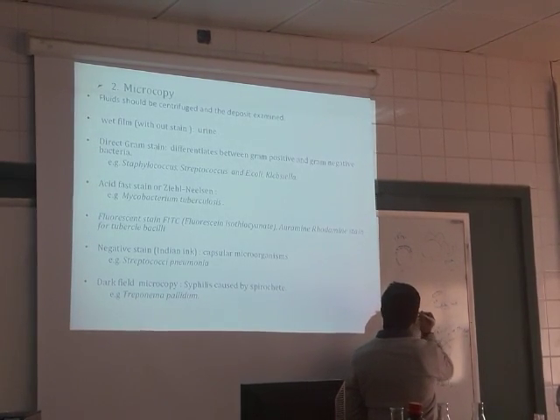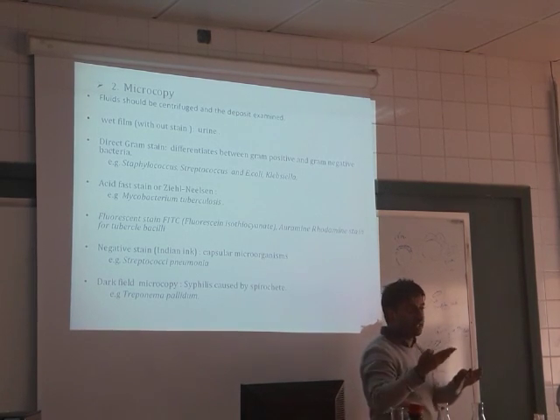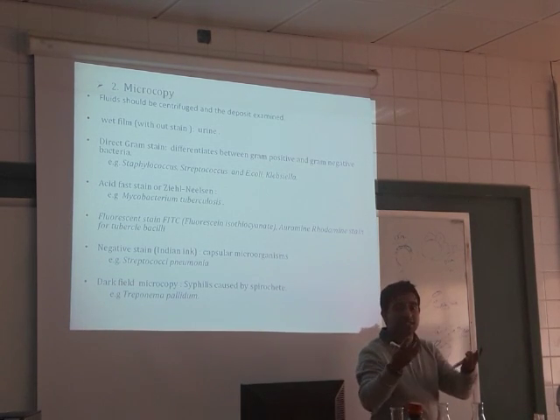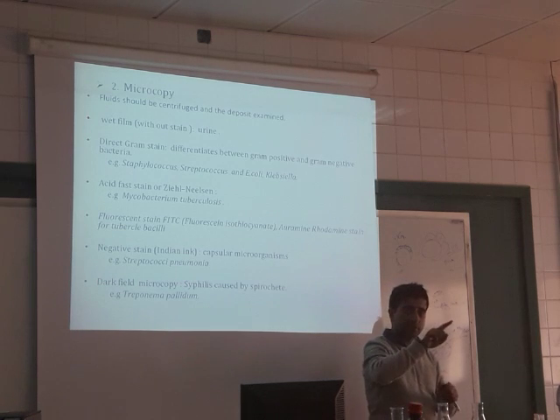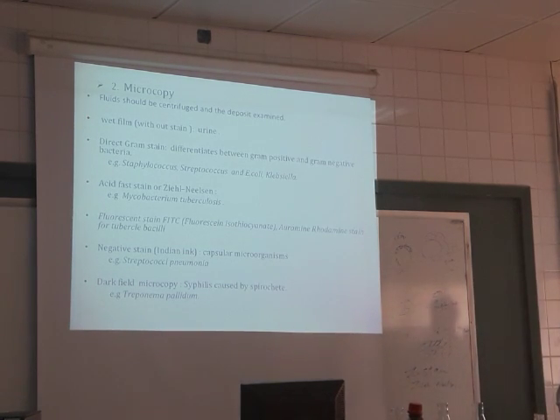And in this case, this is a bacteria, and there will be a covering like this. There will be a huge space, a white space you can see under the microscope. We use this to see whether a capsule is present or not. Because the outer surface of a capsule has a negative charge, you add the dye, and the dye is also negatively charged. When two negatives approach together, they try to go apart and it makes a distance. From there you can see whether the bacteria has a capsule or not.